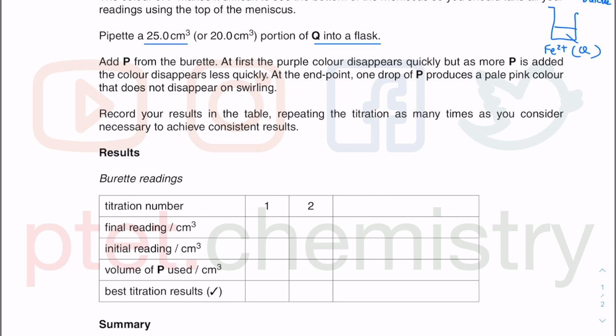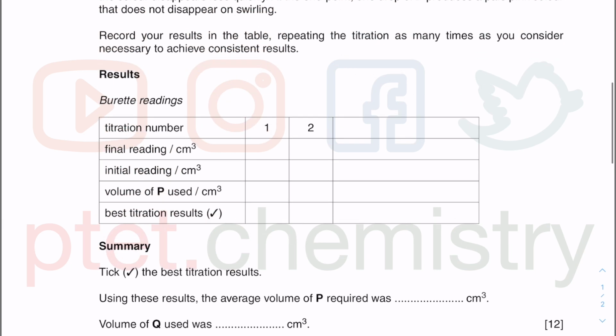Okay, I'm back. From the titration that I have done, my rough titer was started with 0.5. It was based on the video that I have just shown you. So I did a first rough titration, and I have two exact titers that I really want to be as close to each other as possible.